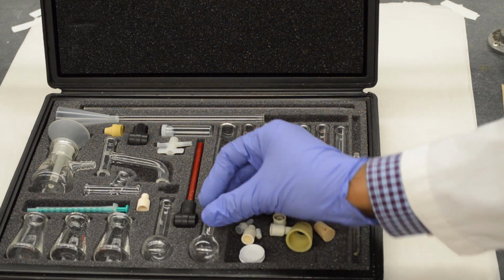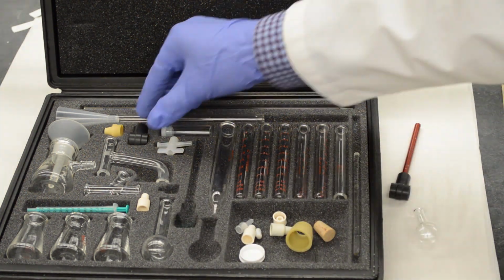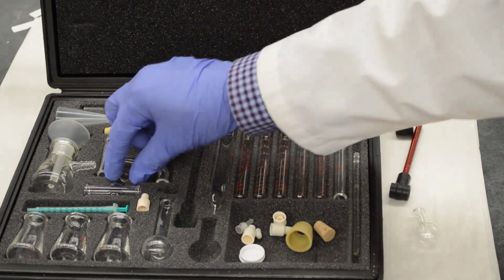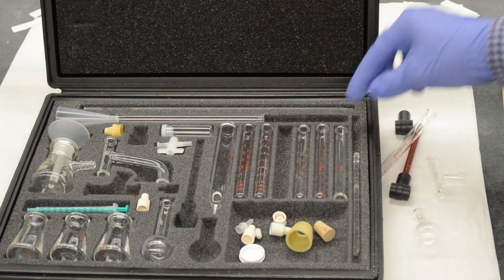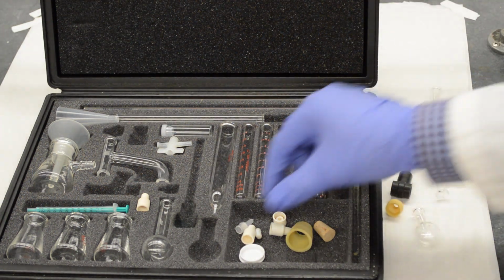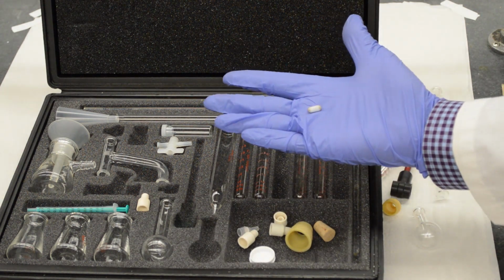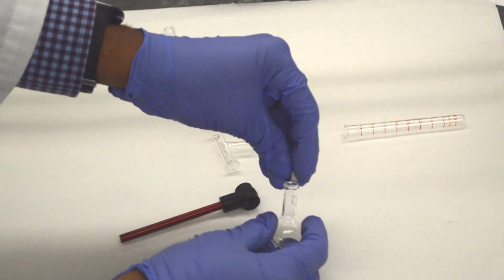We're going to use the glassware in our micro kit. We need a short neck flask, a supporting rod with a connecting rubber piece, another connecting piece, an adapter, a test tube, a condenser, and a sleeve, and maybe a tiny stir bar. Put the stir bar in the round bottom flask.